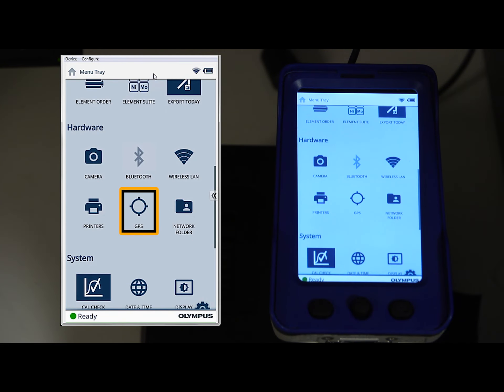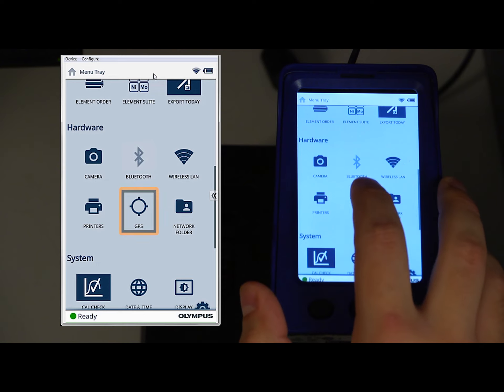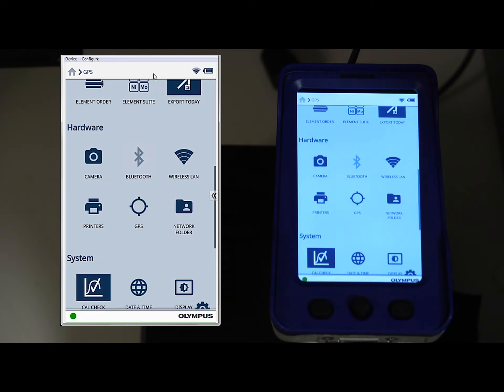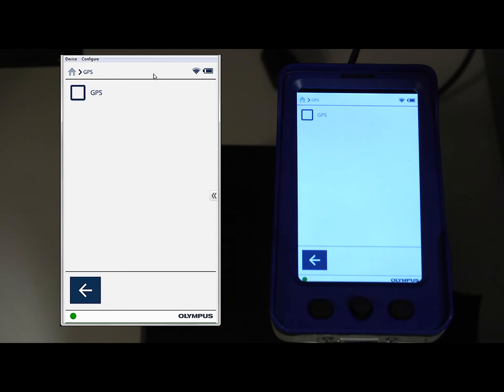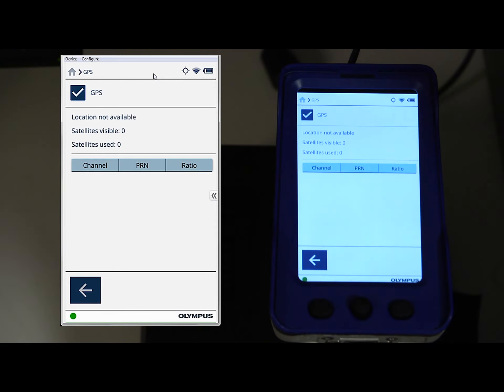Once you're here, you'll see the GPS icon, which is the open circle. Select that icon, and then check the GPS box. This will turn on the GPS.